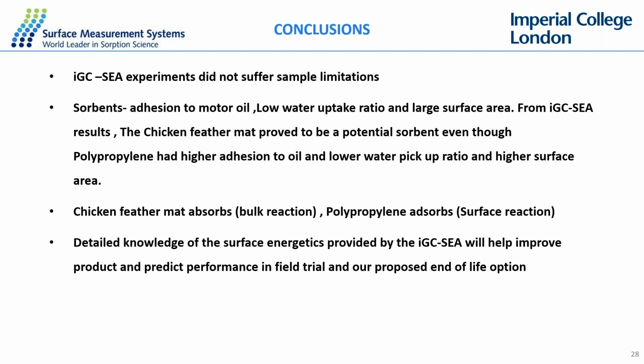And then I could conclude that the chicken feather mat, because that is my main product, is a good sorbent. It has good adhesion to motor oil, a low water uptake ratio, and a good surface area result. If we look at the entire comparison, the polypropylene pad did get better results compared to the chicken feather mat, but the chicken feather mat also has those qualities of being a good and potential sorbent.